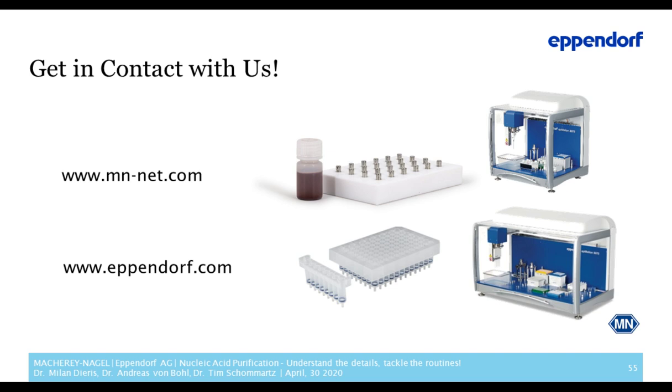And this is then not handled with a centrifuge, but in most of the cases with a vacuum chamber. So instead of using gravity to push your liquids through those filter plates, like with a spin column, you would place it on a vacuum manifold where pressure is used to suck the liquid through those plates. So it's the exact same procedure. It's usually also the same chemistry. It's just a different format of the consumables that you're using.